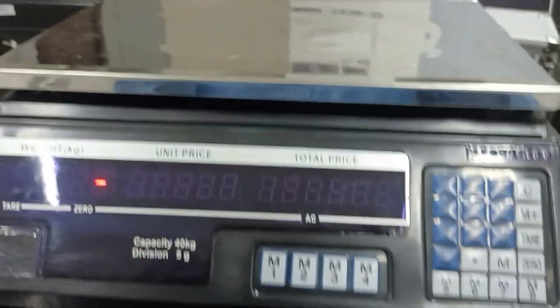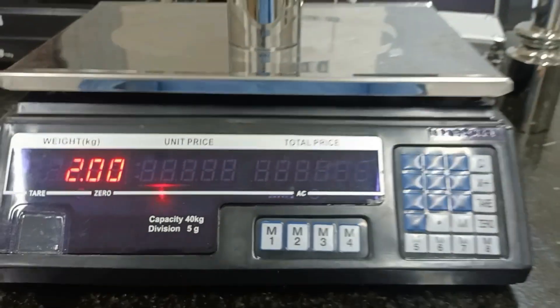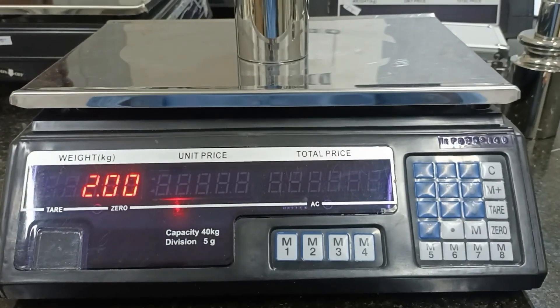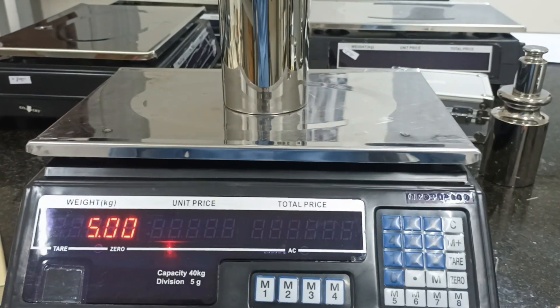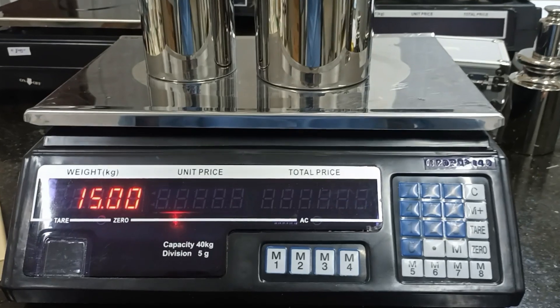After, I will move the standard on the pan and I test again. I will test: 2 kg — yes. 5 kg — yes. 15 kg.